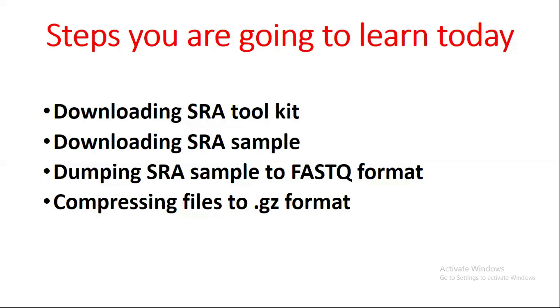In this video, the steps you are going to learn today are: first, downloading SRA Toolkit, which is important for downloading the data; second, downloading an SRA sample — we will download a single sample, paired-end; third, dumping the SRA sample to FASTQ format; and fourth, compressing files to .gz format. These four steps are very important to download FASTQ files related to RNA-seq.